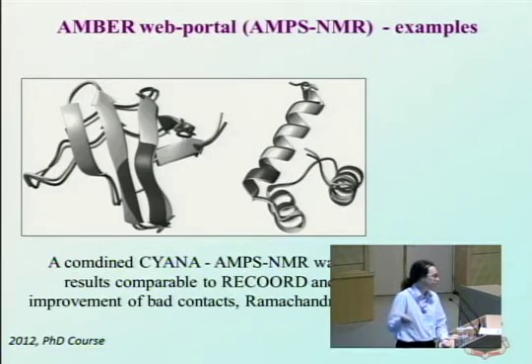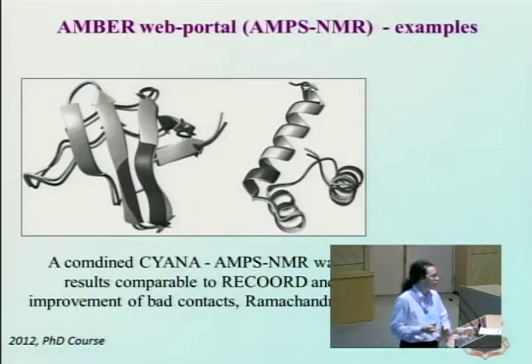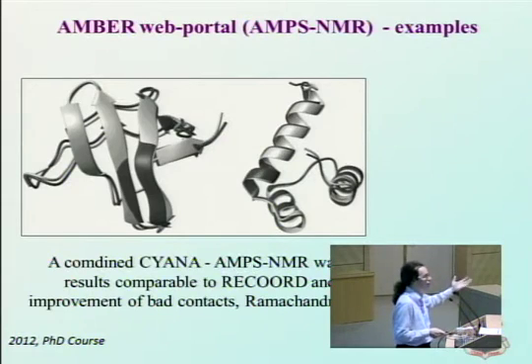Ramachandran, rotamer distribution. Rotamer is the conformation of side chains, and there it is known that NMR is doing a poor job because many side chains, for example, are solvent exposed. You don't get many NOEs for those, and therefore the conformation is randomly generated, basically, by the structure calculation program. So your rotamer distribution is way off what it should be based on the statistics of other structures.